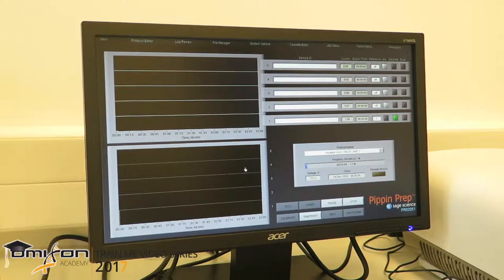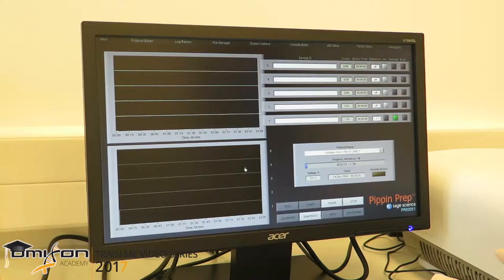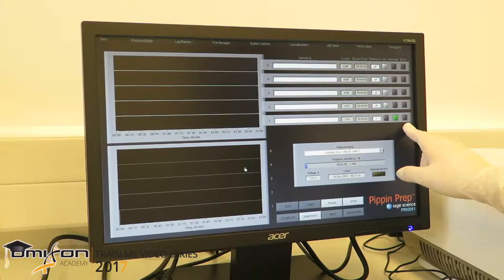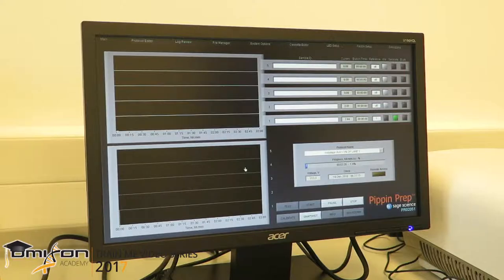The last 8 to 10 minutes of the entire run is the elution time. Right now, fragments are separating just like in any typical electrophoresis. Once the fragment sizes we want to collect reach the collection chamber, the light will turn orange, indicating that the elution process has started. Once the run has finished, everything will turn grey again, just like the unused lanes.